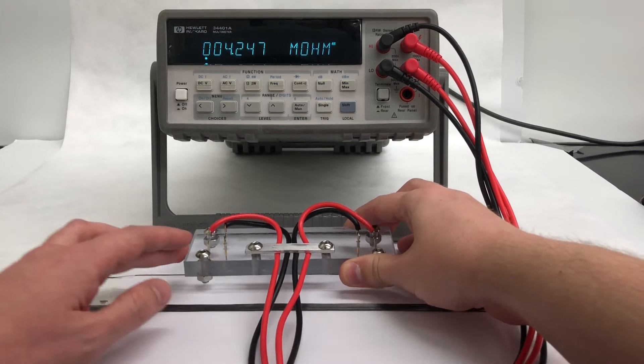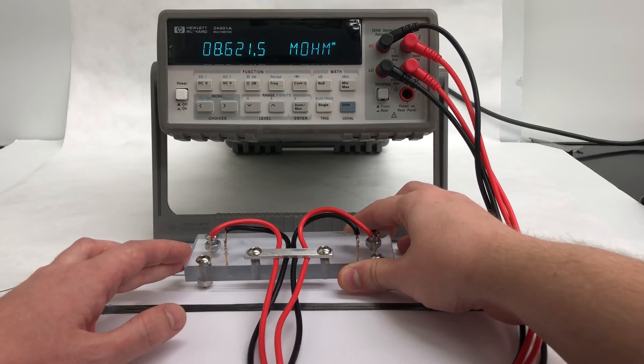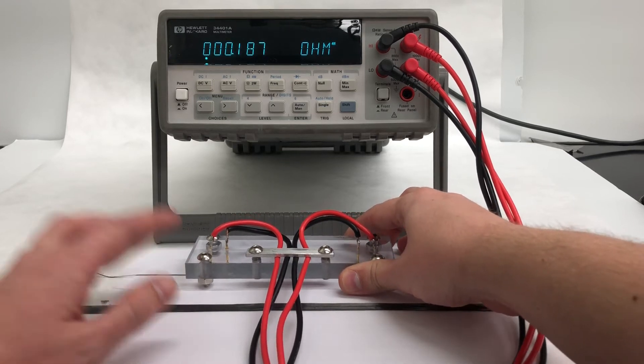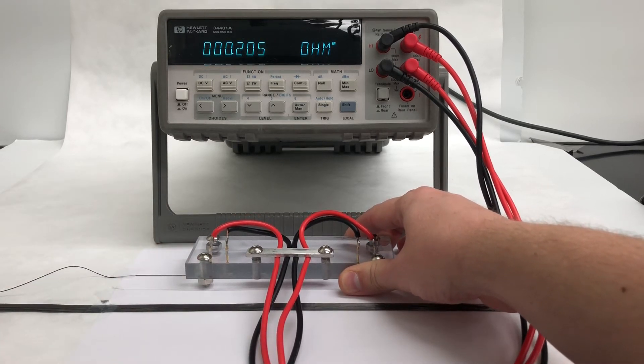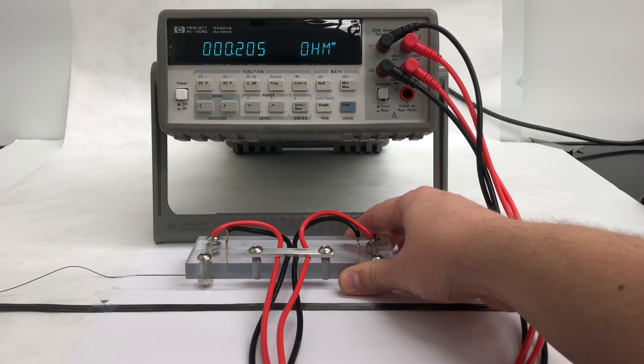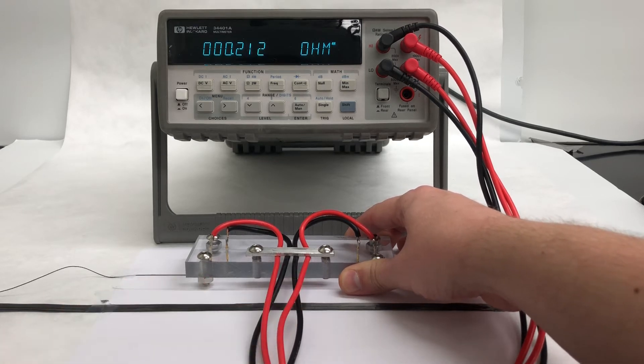Let me align the probes. Yeah, so that's got a resistance of around 0.2 ohms over this 10 centimeter length.